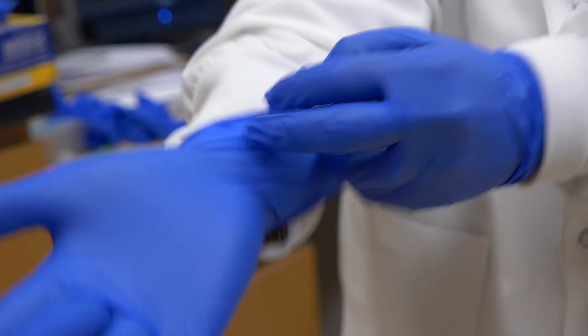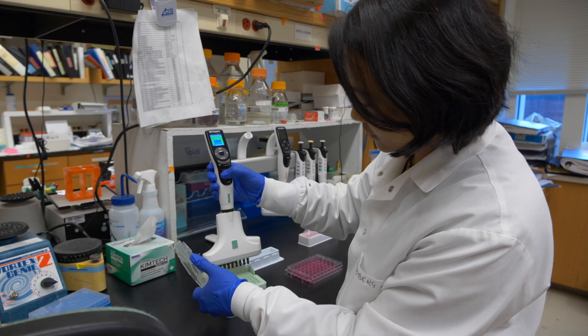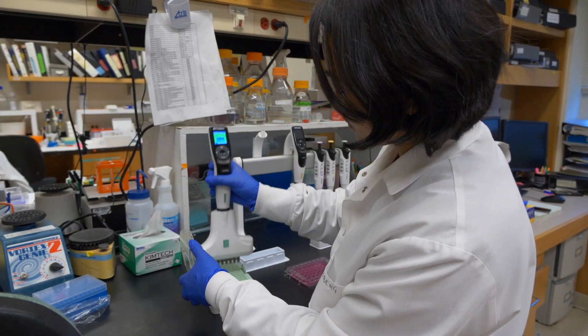The most important thing is it's very precise and accurate, because in my cell viability assay even 5 to 10 microliters would affect the absorbance a lot. It will affect the results, and I'm very happy with it because it's very precise and accurate.